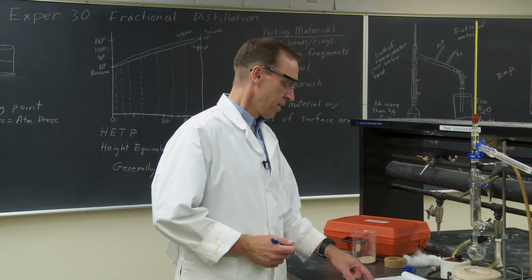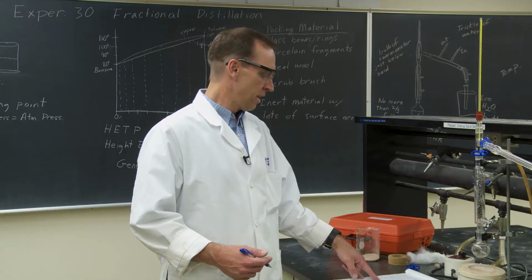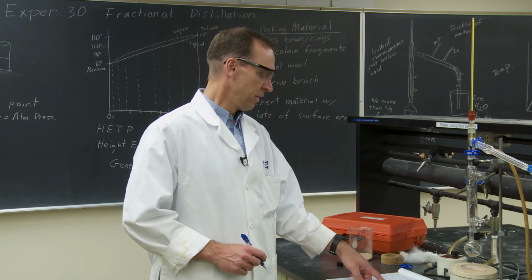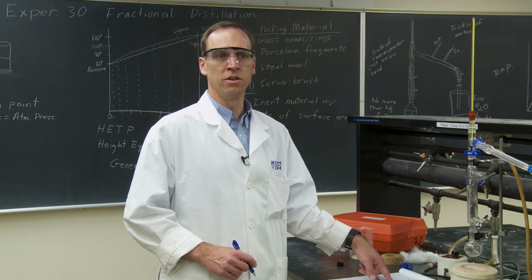Okay, so for my first component, the temperature that I recorded where it had plateaued was 46 degrees. So once you calculate in the change in the altitude and the lower atmospheric pressure at our altitude, that would be bumped up to around 50 degrees Celsius. And then on the 74 degrees Celsius, for my second component where it had plateaued, that would be adjusted to around 80 degrees for the plateau. So make sure you take care of the change in altitude correction.